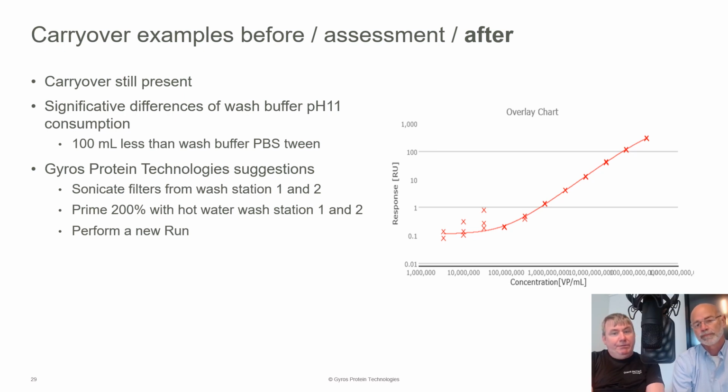And then this is becoming more and more of a regular maintenance, isn't it? Yeah, I think so. For folks that are using pH 11 as a default solution, they'll want to do that regularly as part of their wash station maintenance to mitigate the potential for wash station clogging. I know we had a whole discussion around this at the user meeting in Europe, and it seems we're now recommending more and more customers do this hot water wash.